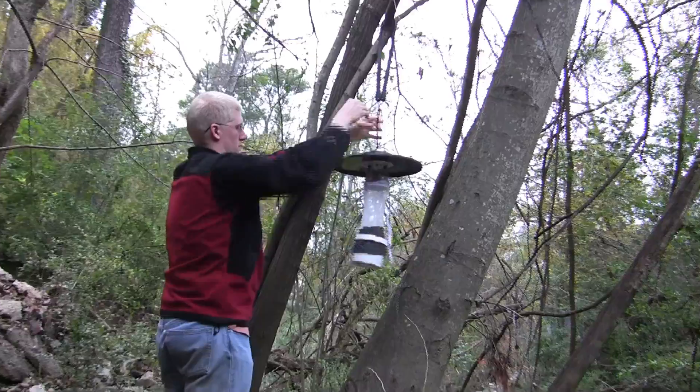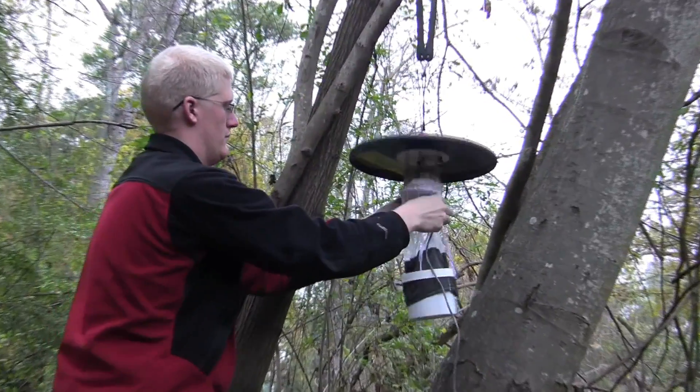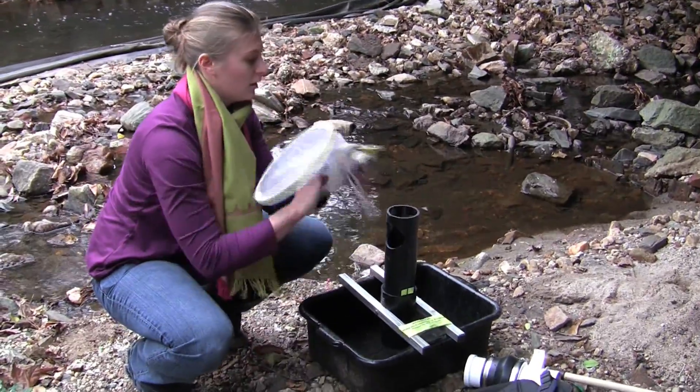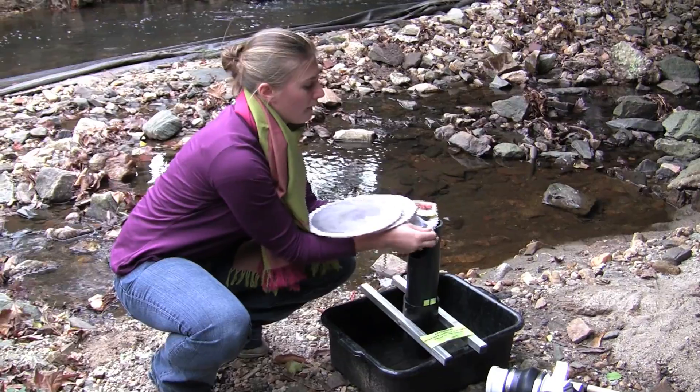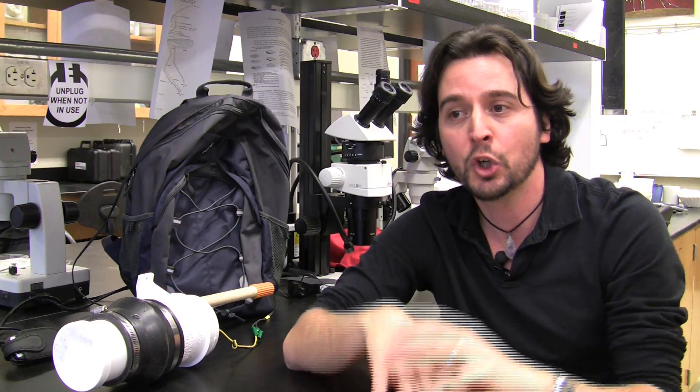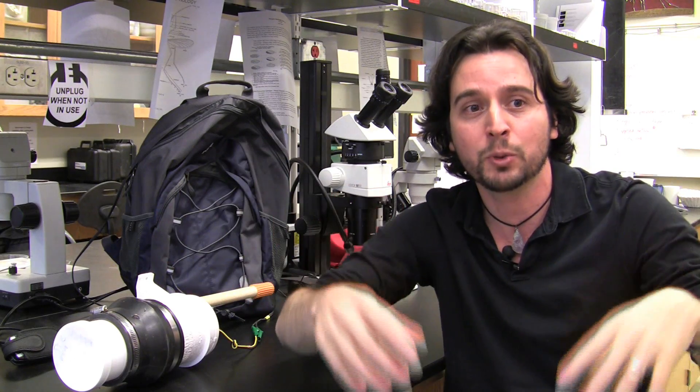There are many different methods to collect mosquitoes, and those methods have been evolving over time — like traps or gravid traps. There are devices that use a vacuum or aspiration and allow mosquitoes attracted to a source to be aspirated and contained. Other methods collect mosquitoes not when they are attracted, but when they are resting in particular areas. Those are what I call mosquito aspirators.